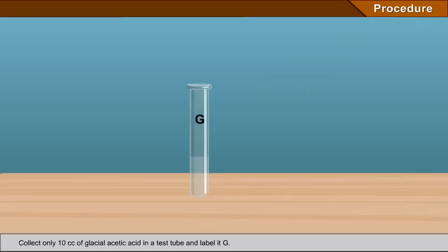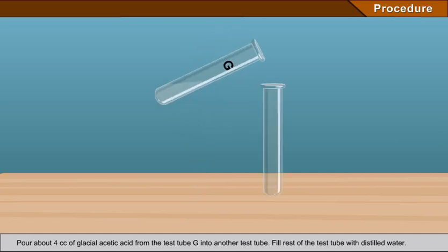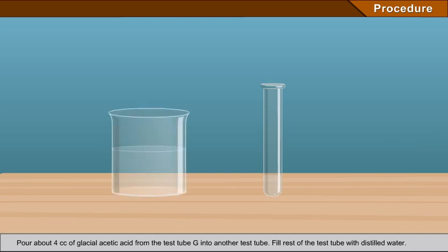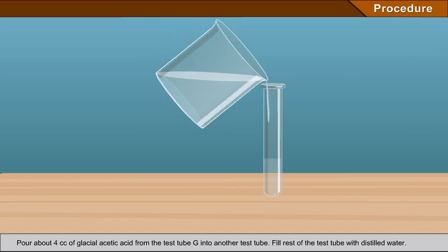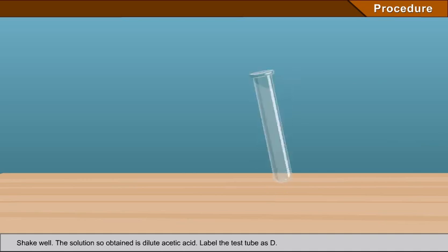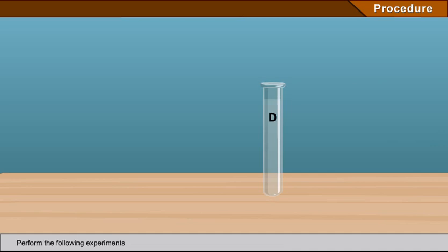Procedure: Collect 10 cc of glacial acetic acid in a test tube and label it G. Pour about 4 cc of glacial acetic acid from test tube G into another test tube. Fill the rest of the test tube with distilled water and shake well. The solution so obtained is dilute acetic acid. Label the test tube as D.